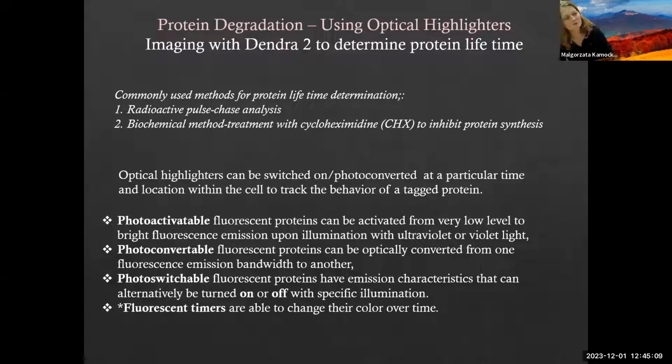So I wanted to show you one study which I did a long time ago with Dr. Bascotto from Italy, who was always very happy to look at new modalities, new possibilities of imaging, and he was very enthusiastic. We did wonderful studies with an optical highlighter, which allowed him to determine the half-life of the protein of interest. And he also did a PLA assay, which I will talk about in a moment.